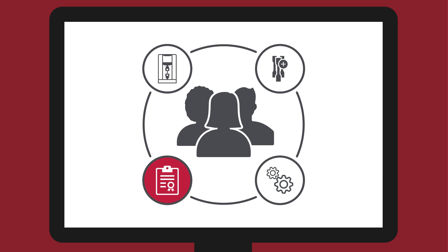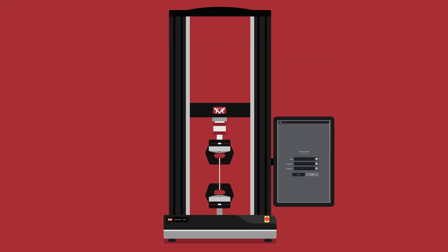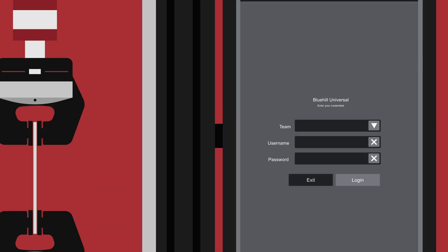When logging into Blue Hill Central or Blue Hill Universal, an operator's team and user credentials control the test files and settings available to them.